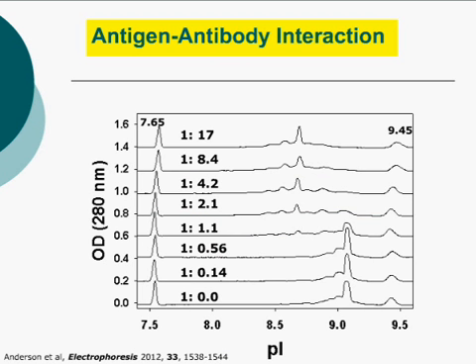Monoclonal antibodies in general are known to contain charge heterogeneity, and the acidic forms of some monoclonal antibodies have been demonstrated to reduce the binding ability to their antigens and therefore lower potencies. Therefore, assessing the binding ability of these acidic forms is normally evaluated using a combination of different analytical methods and can be a very tedious process.